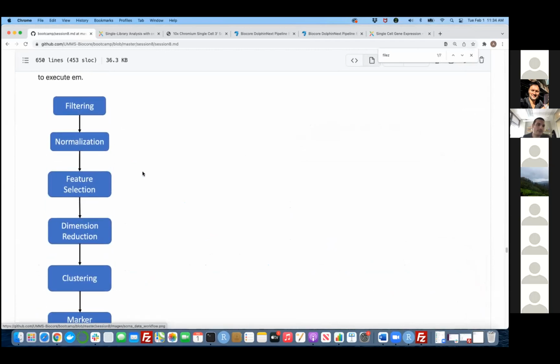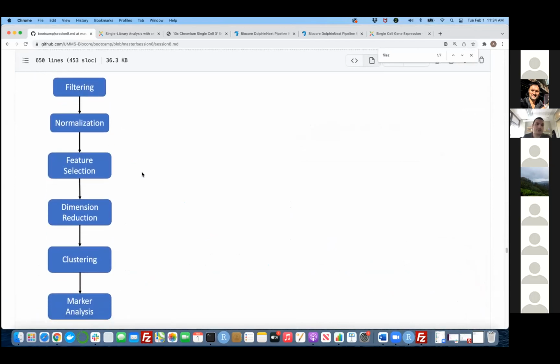So what we're going to start with is filtering. Single cell RNA-seq is a long process. You have to make sure first that your cells are of high quality, that you can start analyzing them, because it's going to be important for normalization. You don't want to normalize a cell which doesn't look like a cell. Sometimes we have debates over what actually constitutes a cell, what is the appropriate number of UMIs in order to consider a barcode as a cell, to make sure that it's not a bad cell or it has a high amount of UMIs to be analyzable.